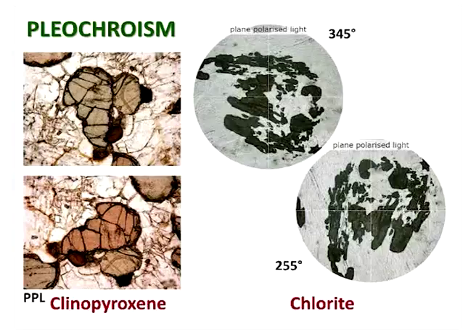So on the left is clinopyroxene, and you might have seen it confidently described as having green and pink pleochroism, and this is the strongest green-pink pleochroism I could find. Those are quite strong colours for clinopyroxene, and it's very, very rare for it to have that strong a colour. But there you can see the lower one is a kind of pinkish, orangey colour maybe, and the one at the top, which has been turned through 90 degrees, is that kind of greenish colour, which again looks basically grey, but to my eyes has a greenish tinge. And that's the extent of pleochroism you'll see in clinopyroxene.